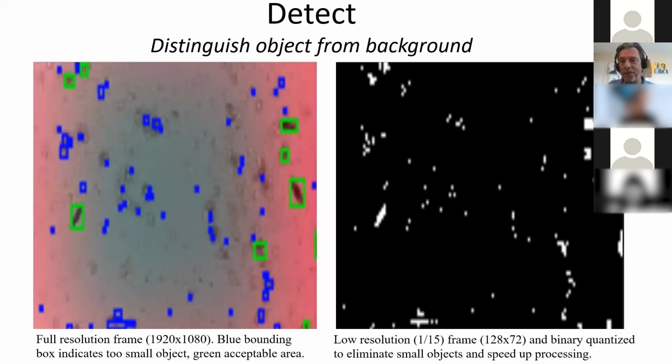I'm going to quickly breeze through the different functions you're going to learn how to do, and the purpose of them. So detection is the first thing you're going to learn how to do, which is to separate the object from the background. And in your career, I'm sure you're going to work with microscopic images from confocal microscopes, light field, dark field microscopes. The same algorithms you're going to learn in this class, you can apply to that.